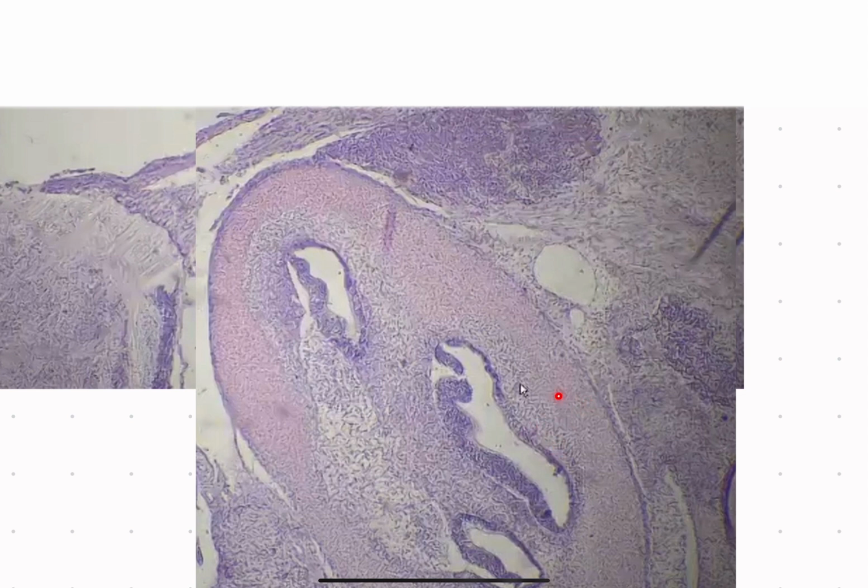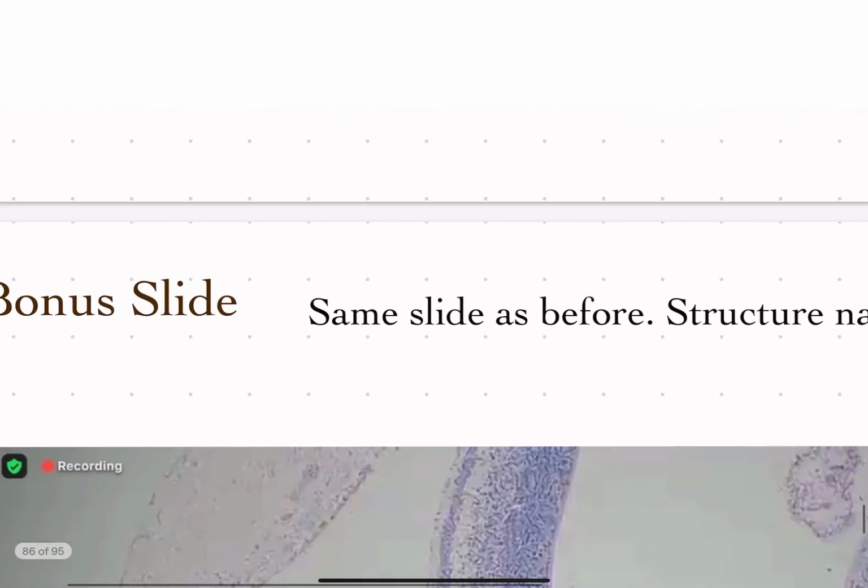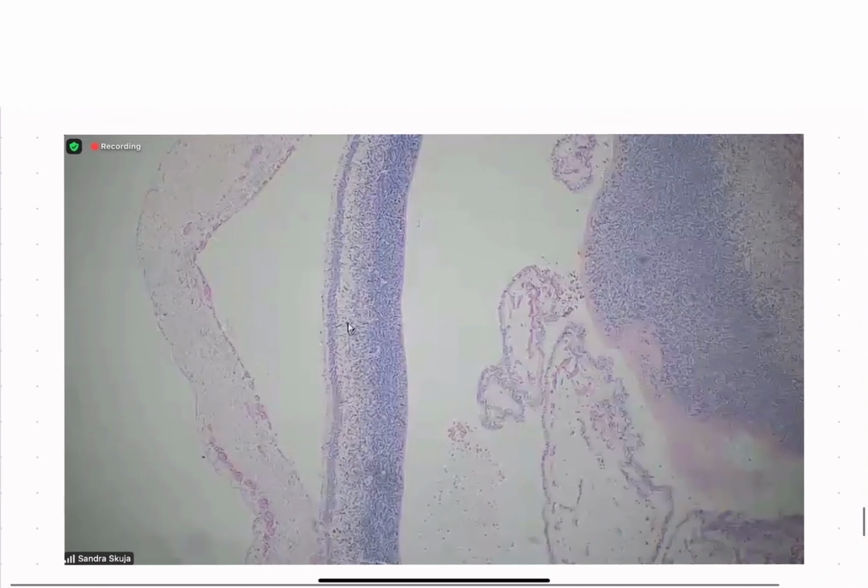And then if you feel done, feel free to review your answers. I'm also going to show you some bonus structures at the bottom. Okay, bonus structures. We're in the same slide as before, but this is what you see in front of you.